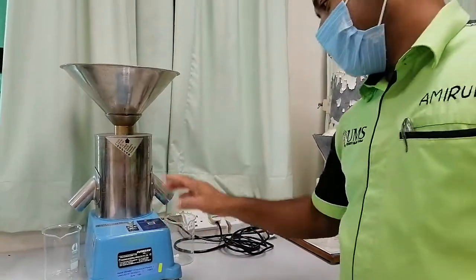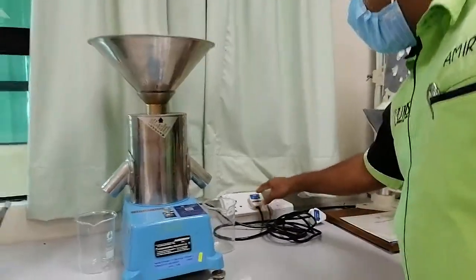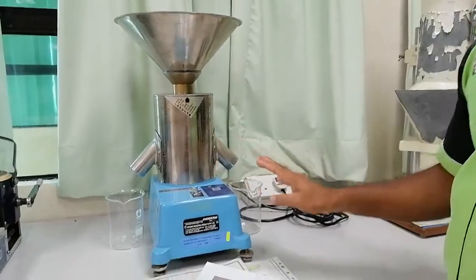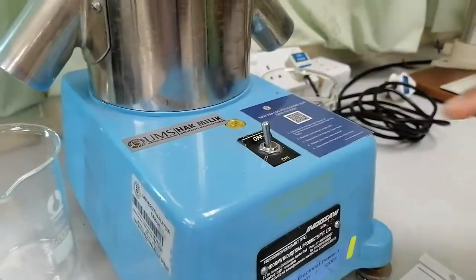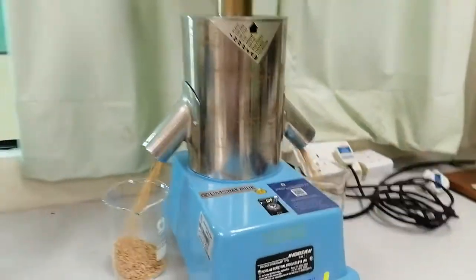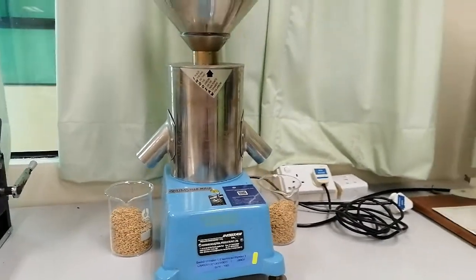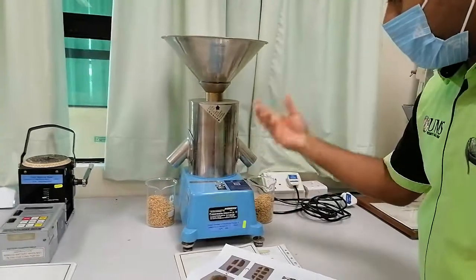So this is the switch — one off. This is the power cable. Insert the power cable with the power, and there is only one on and off. There is nothing else — very easy. Just keep the on and off. On. You can see. Now we can turn it off. This is continuously on.